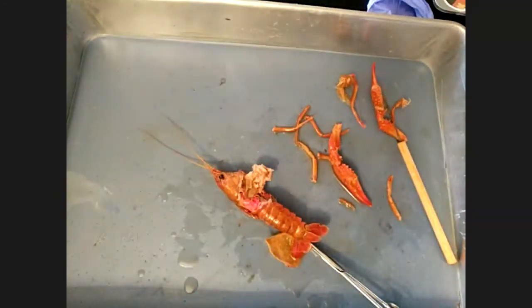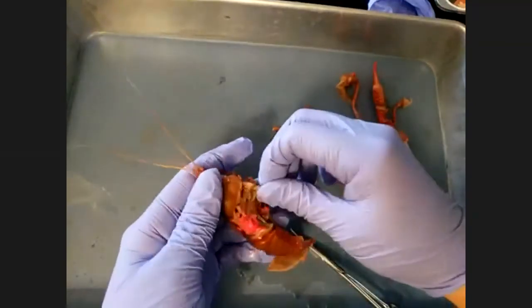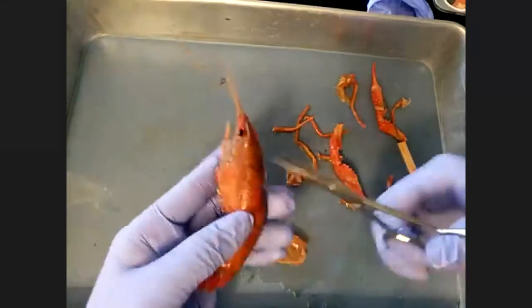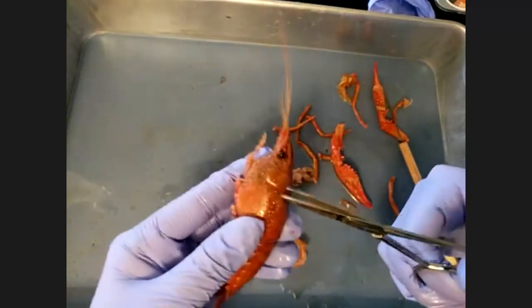What happened to my... Okay. So along with doing that side of gills, I'm going to do this side of the gills because I need to get at some of the more internal structures.